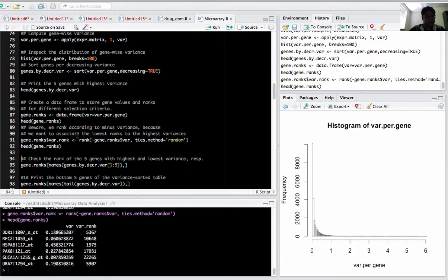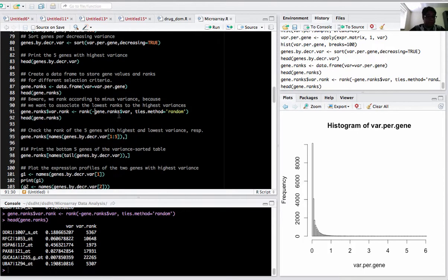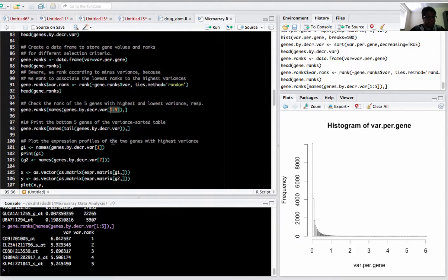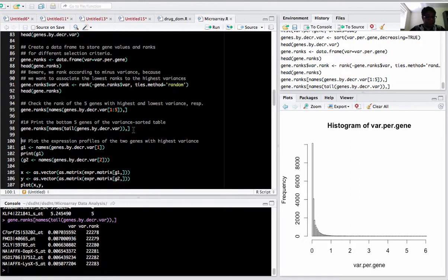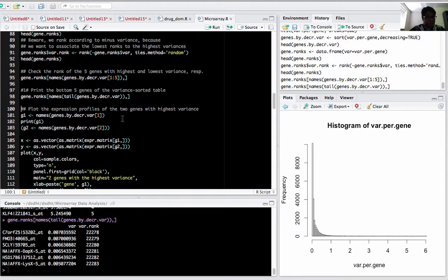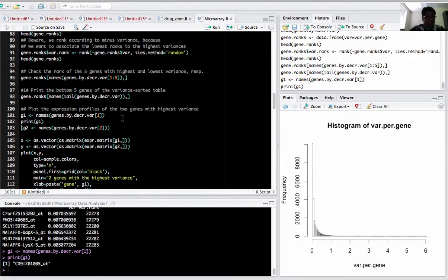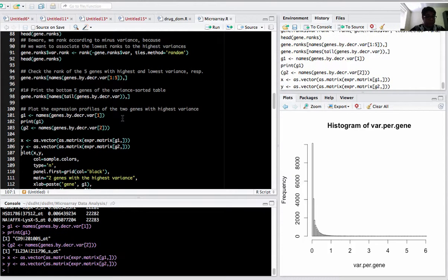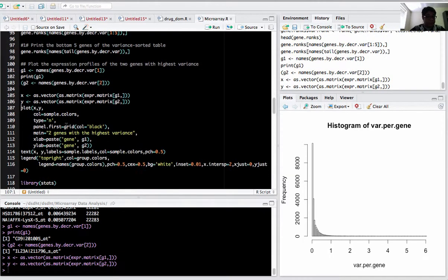If you want to check the top five ranked genes with highest to lowest variance, use gene ranks names and top five. For the bottom five, use the tail command to see the bottom rank genes. To plot the expression of the two highest variance genes, I collected the gene names - first gene and second gene - then took the expression matrix for that.